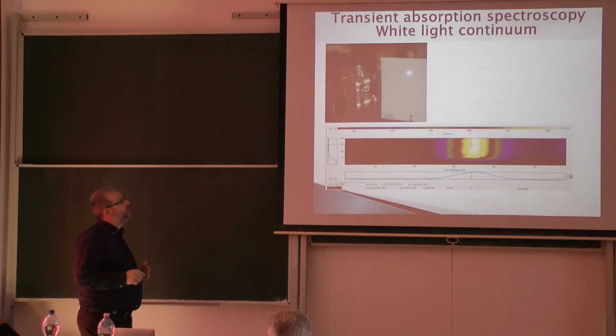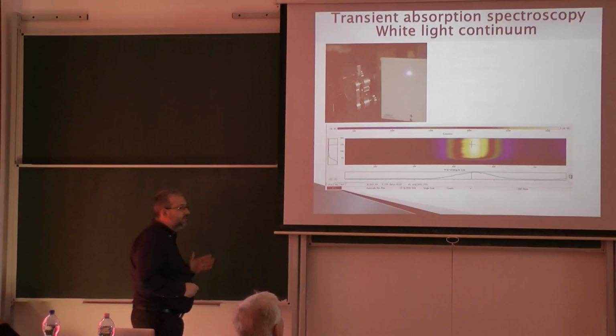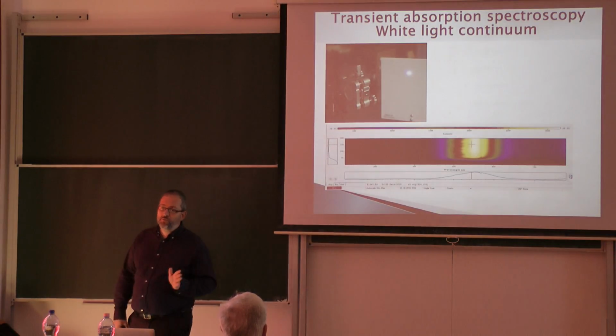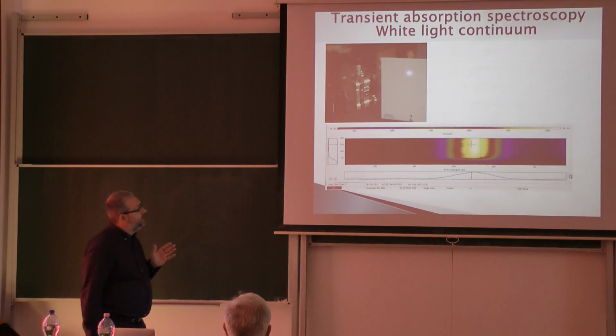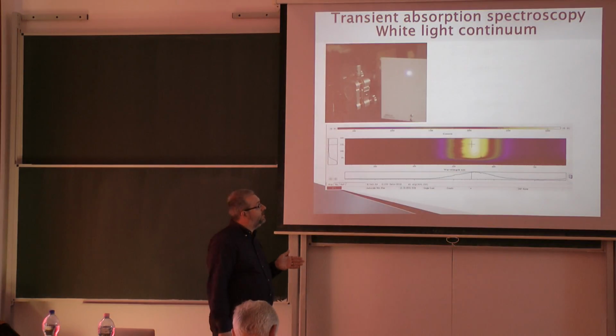That's why we are using calcium fluoride. The only disadvantage of calcium fluoride is you have to move it, faster or slower, doesn't matter, but you have to move it, otherwise it will crack, as the pulses are quite energetic here.